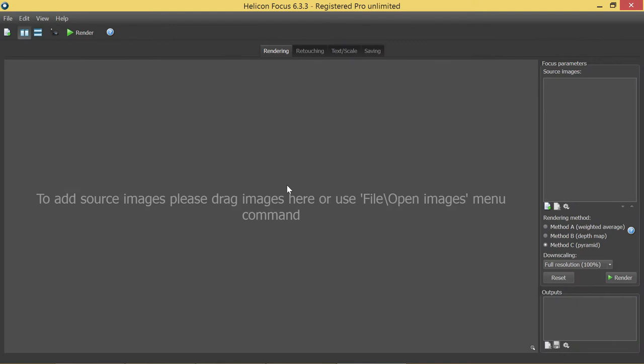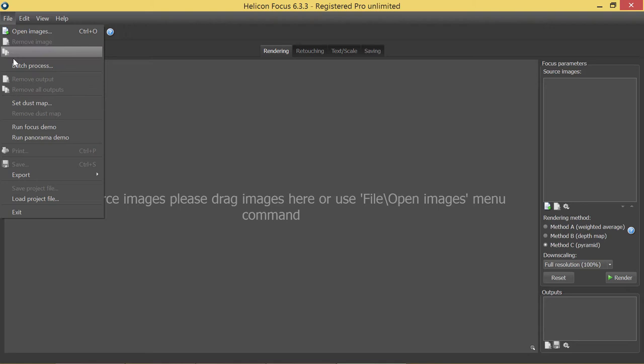The main idea of this mode is to enable batch processing when you can add a number of stacks to the queue, start rendering and have all the results automatically saved to the disk.